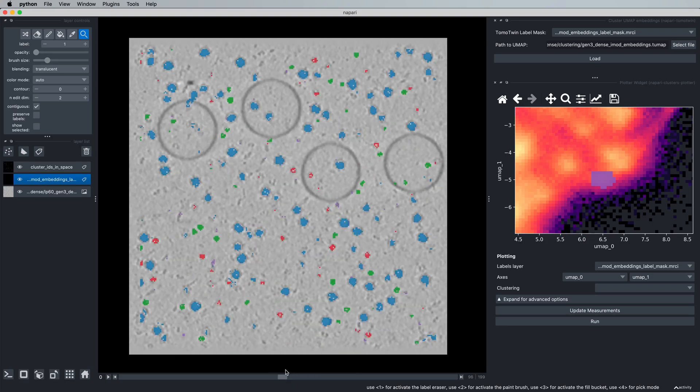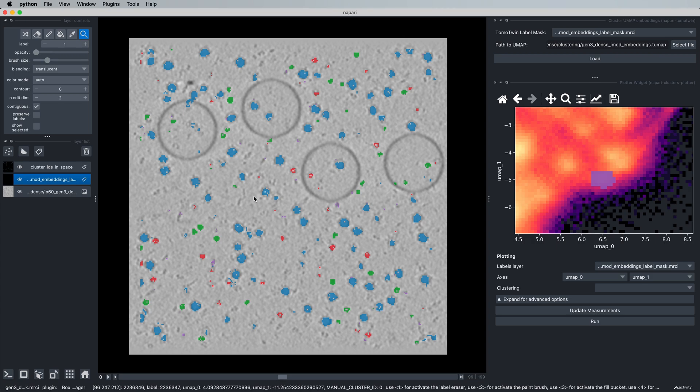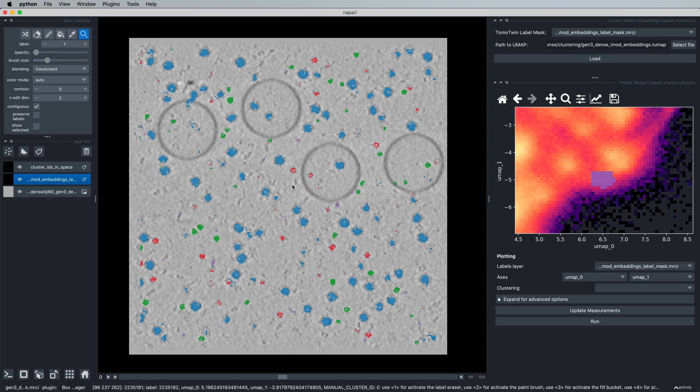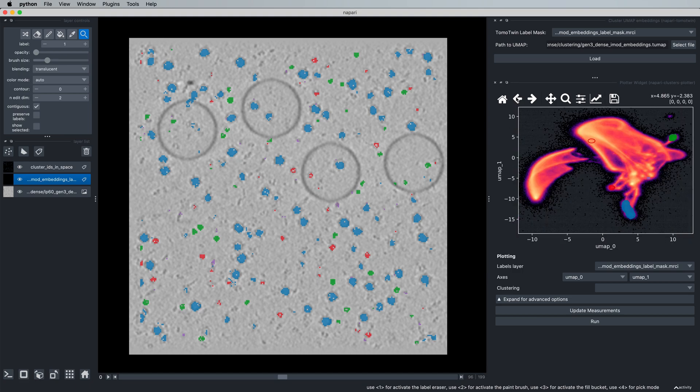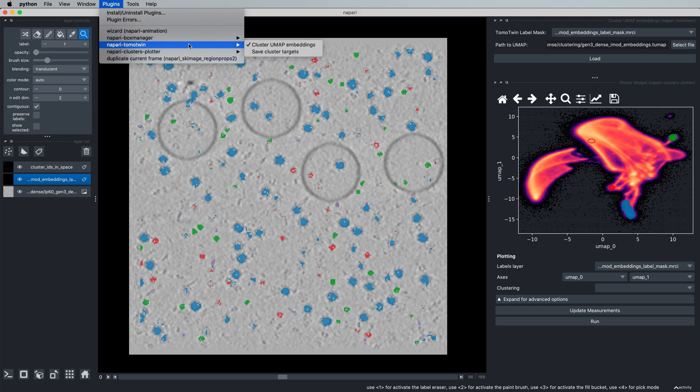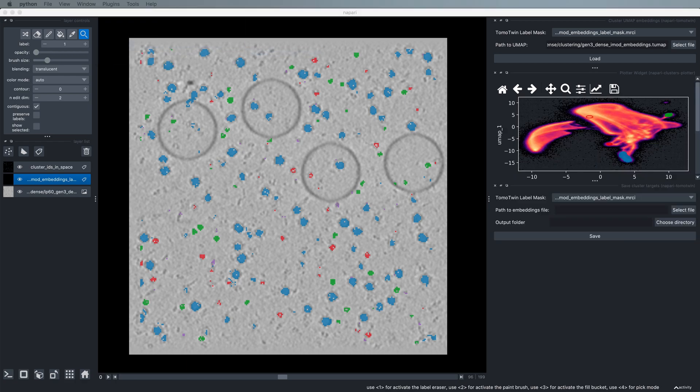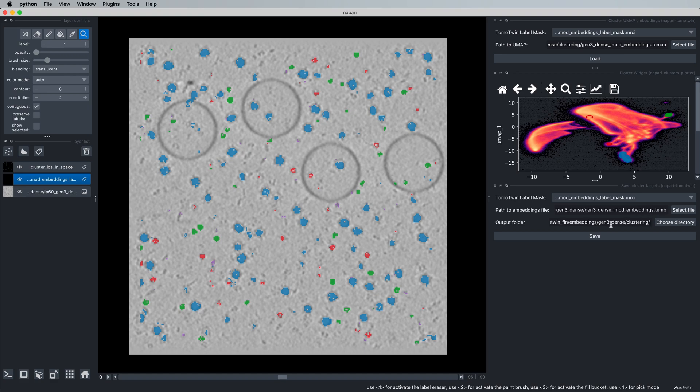From here, we would want to save targets from these embeddings to pick these proteins in this tomogram as well as other tomograms within our dataset without having to repeat this process. So in order to do this, we can come up here into Plugins, Napari TomoTwin, Save Cluster Targets. Now we simply need to provide a path to our original embeddings file because we want to calculate the targets in 32 dimensions and not in our two-dimensional map and provide an output folder.